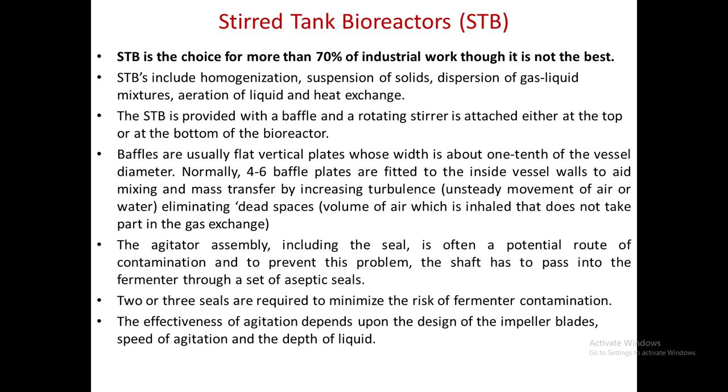Baffles are usually flat vertical plates whose width is about 1/10 of the vessel diameter. Normally 4 to 6 baffle plates are fitted to the inside vessel wall to aid mixing and mass transfer by increasing turbulence, the unsteady movement of air or water, eliminating dead spaces.